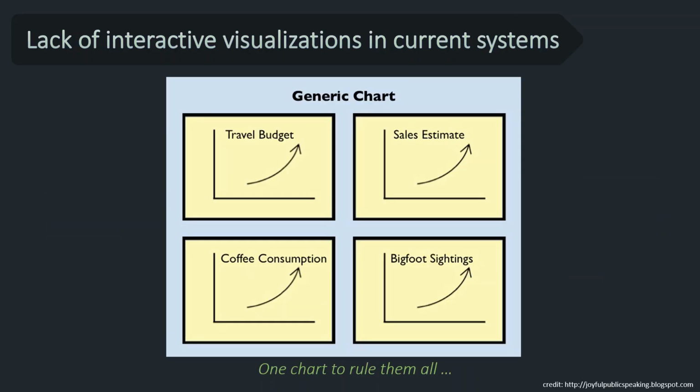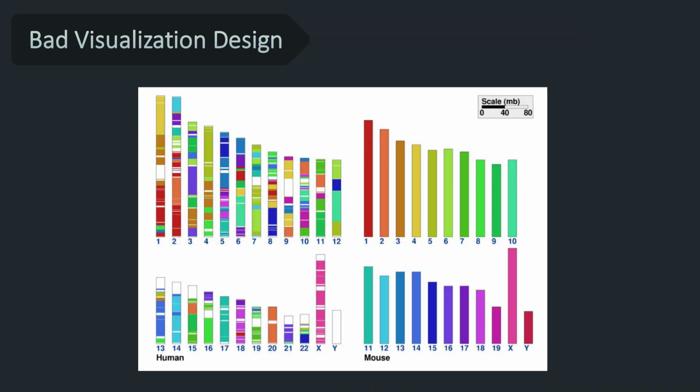However, one of the biggest impediments to using genome visualization tools that currently exist is that they do not support a wide variety of investigation tasks and often have limited or no interactivity and purely exist as chart generation systems. This makes it difficult for researchers to understand the rich characterization of the complex genomic datasets that they sequence.